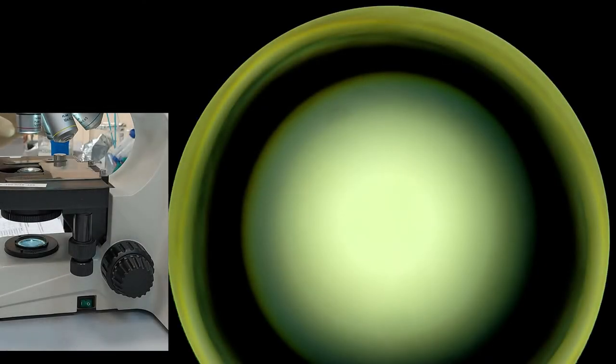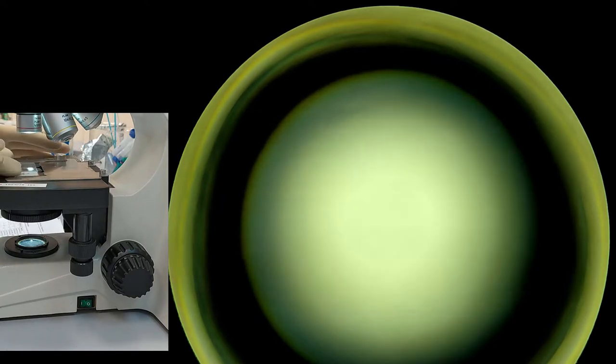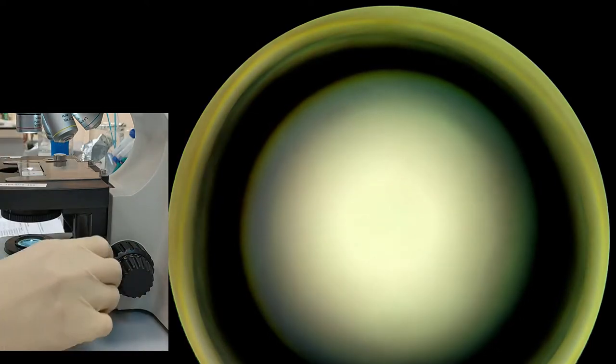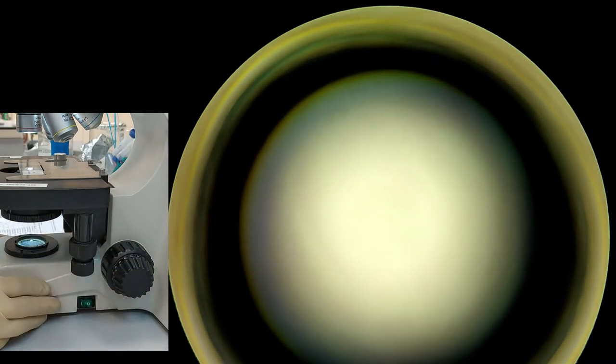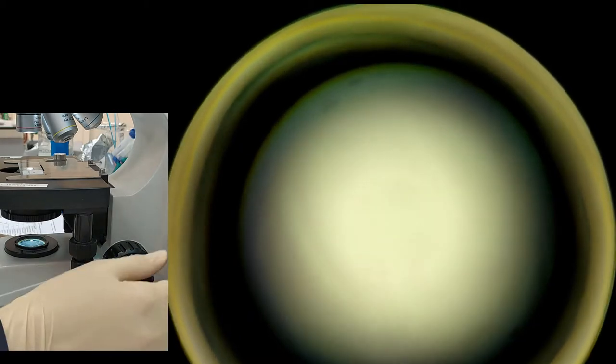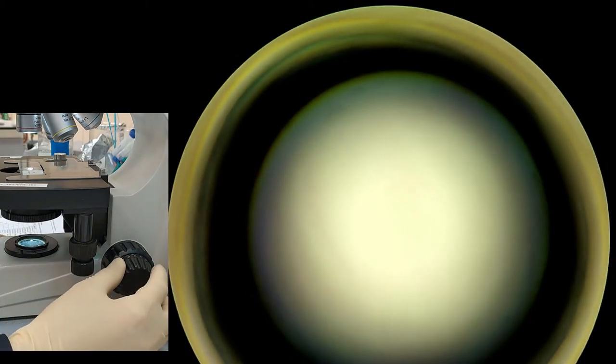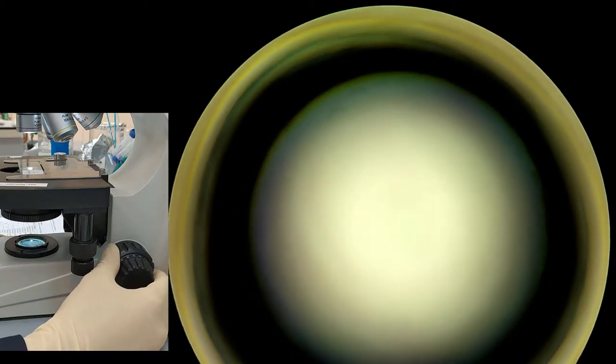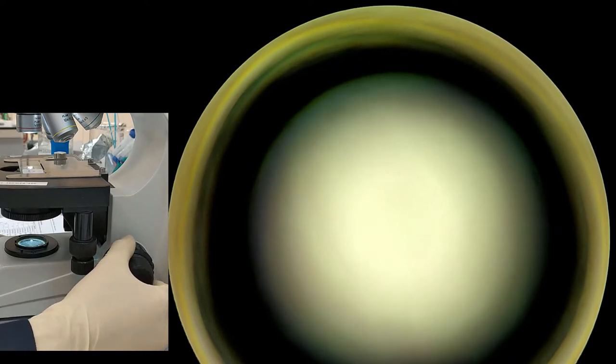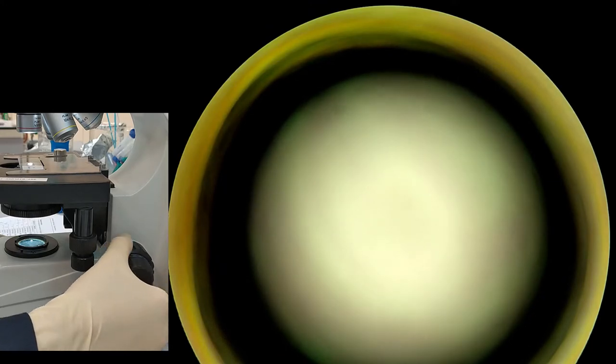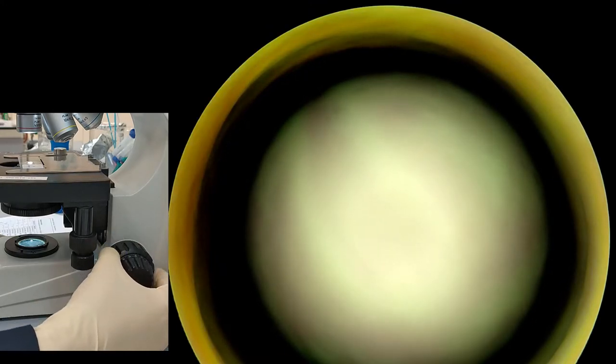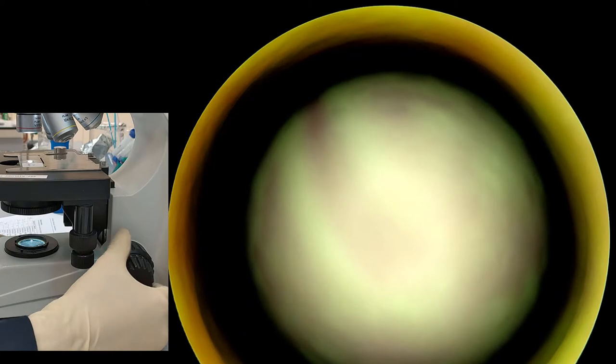Okay, so we always start with the smallest 4x objective. Place your sample here, roughly center the view, and then start with the knob so that you can see it more or less detailed in your view of the camera.